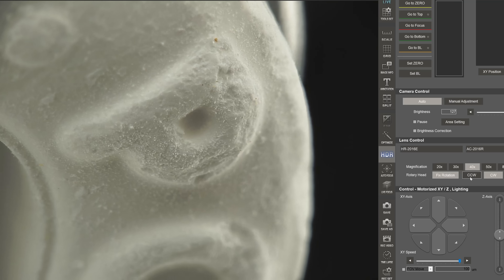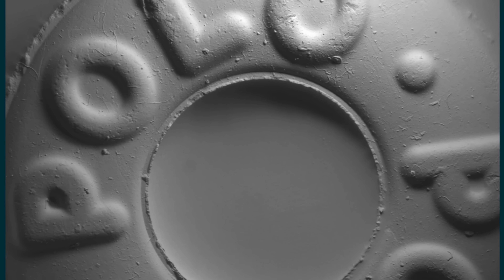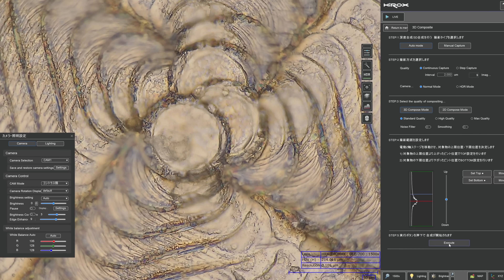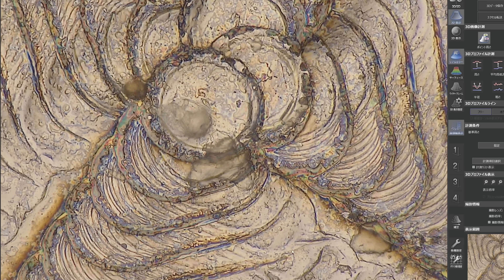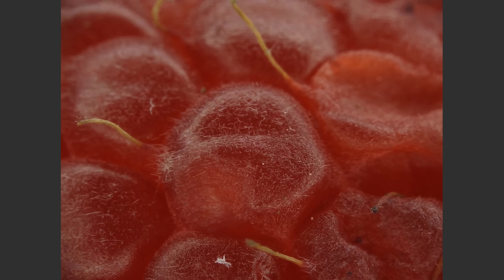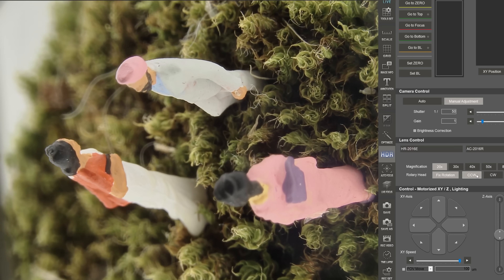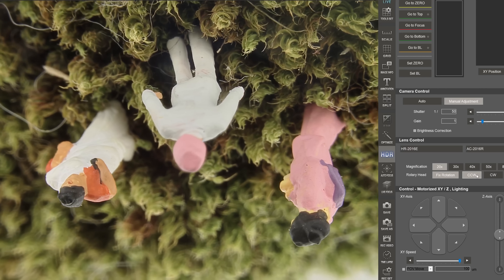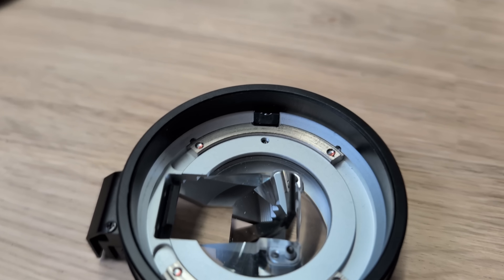I had to show you what a polo mint looks like under this microscope because it links to one of my favorite images from a video I made about the GelSight touch-based microscope. But this microscope calculates depth information differently. With this microscope, the depth of field is really narrow, meaning only a thin slice of the image is in focus. So by analyzing which parts of the image are in focus when the microscope is at different heights, they can figure out the topology of the thing being scanned.